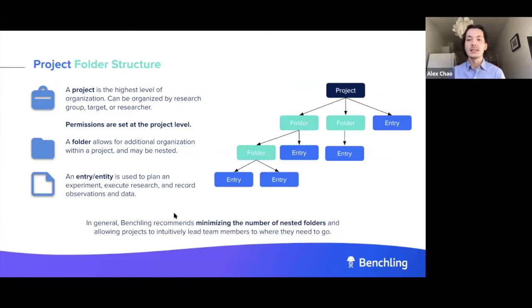As I'll be demoing today, we have a powerful global search application within Benchling that gives you a lot of precision to be able to find your notebook entries as well as any of the other data that you're working with on Benchling. So we really see searching as the primary way that folks are able to find their data as opposed to a complicated folder structure.